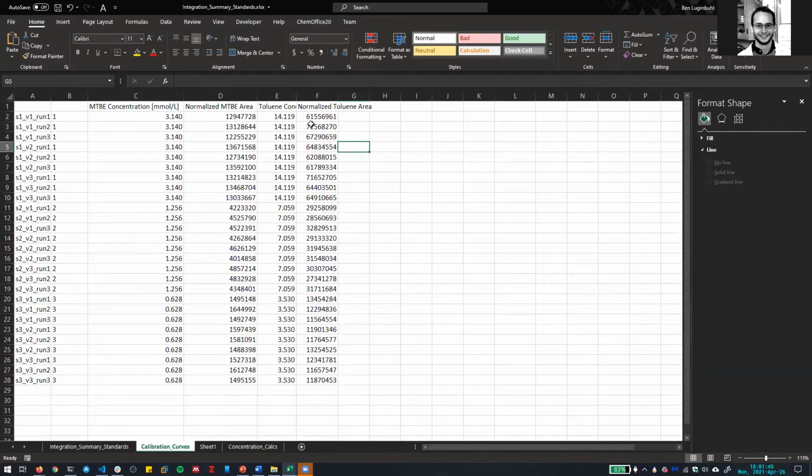I don't know if anyone was watching, but I started filling in these formulas here to do all the lookups from the other data so that you only have to change it in one spot. Is that going to be easier in Python? Yes. It's going to be a little more complicated to understand, probably, because we're going to be using code and pandas to do this. You won't be able to see all the data necessarily, but it'll be faster and easier. You basically just have to type a couple lines of code.